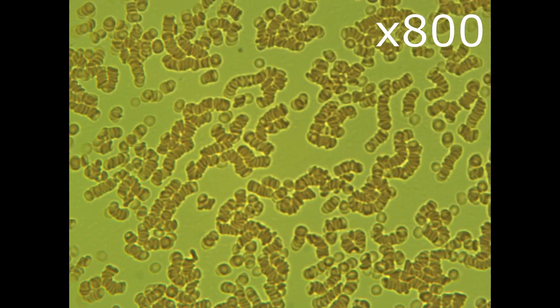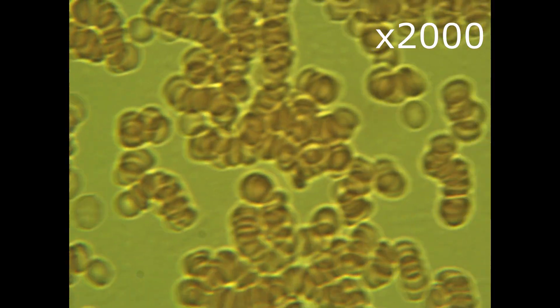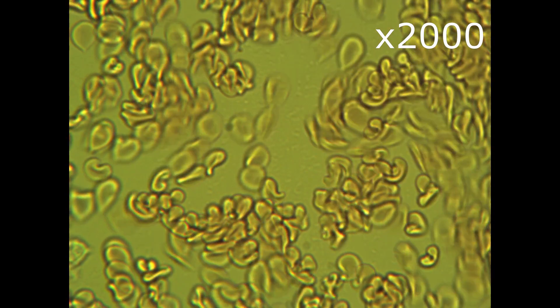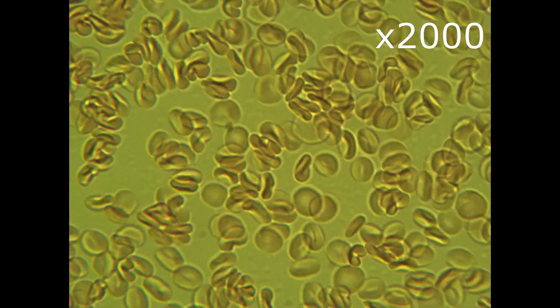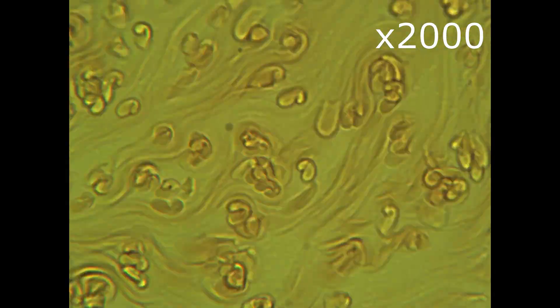And now 2000 times. We can now see how islands are formed. Surprisingly the flow is not impacted. Blood moves as freely as before taking stevia, perhaps slightly better.